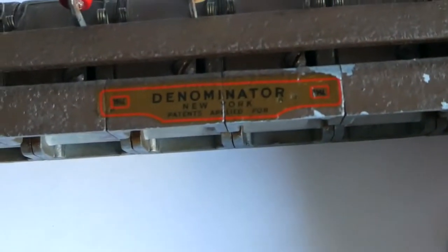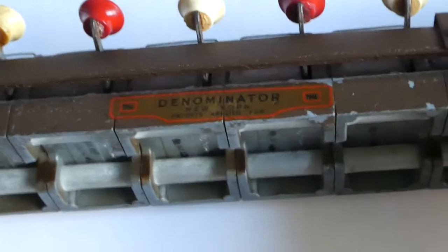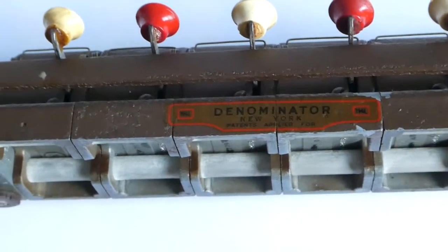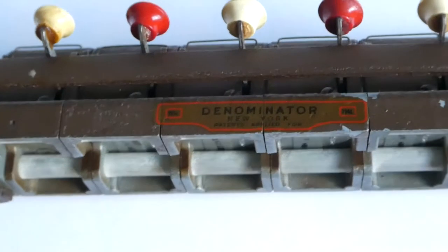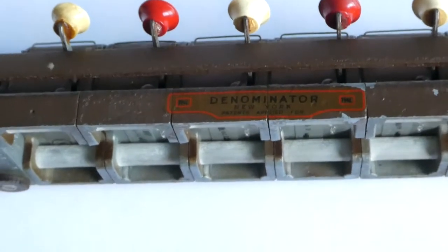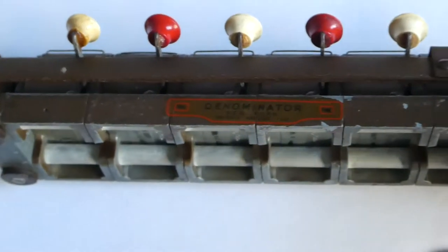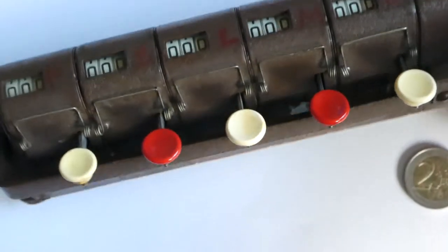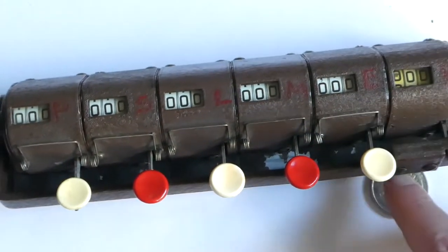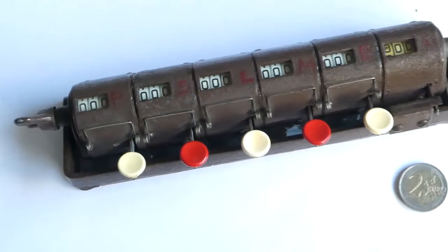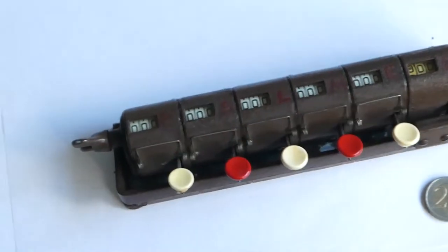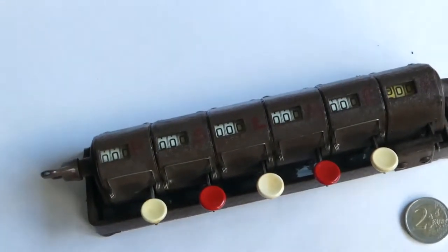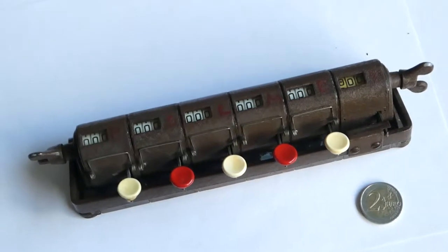This machine was made by the Denominator Company. That company was founded in New York in 1914, and the name is because their first product was a counter similar to this, but with 11 counters, one for each denomination of money, from one cent, nickels and dimes, all the way up to 20 dollar notes.